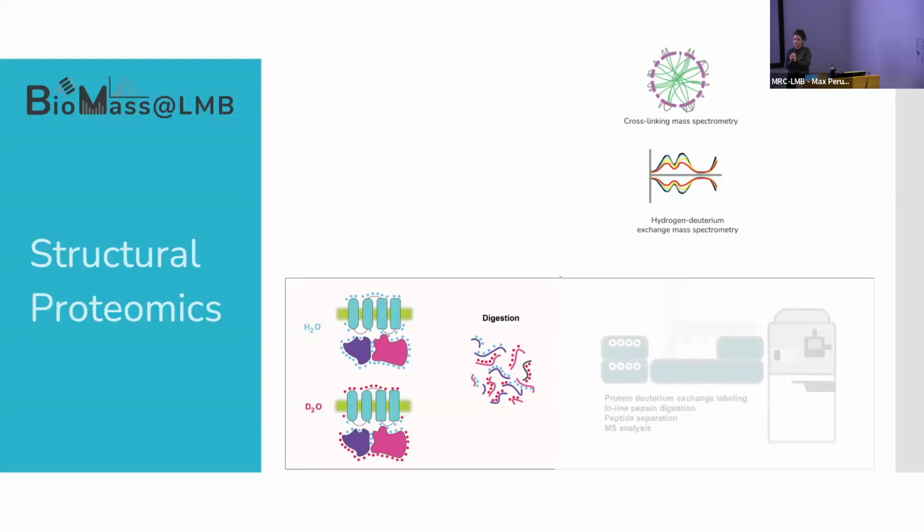The peptides that have higher incorporation of deuterium will be the ones that are more exposed, whereas the ones that are more conservative in terms of the differences in masses are the ones that are protected from the exchange. From this information, we can see which are the structures that are more superficial or have very variable regions, so we can study this.